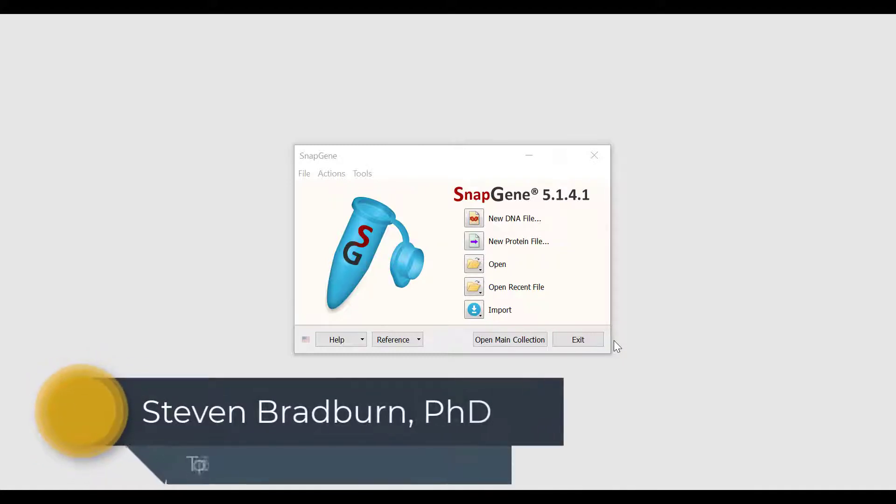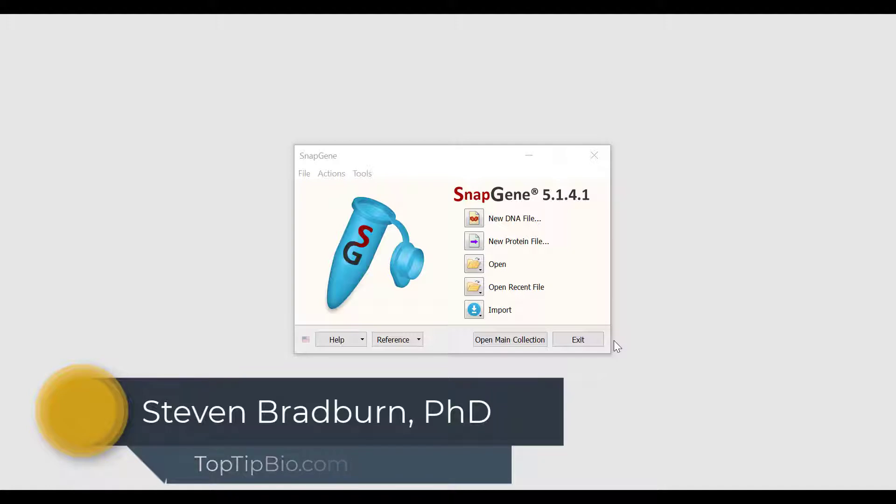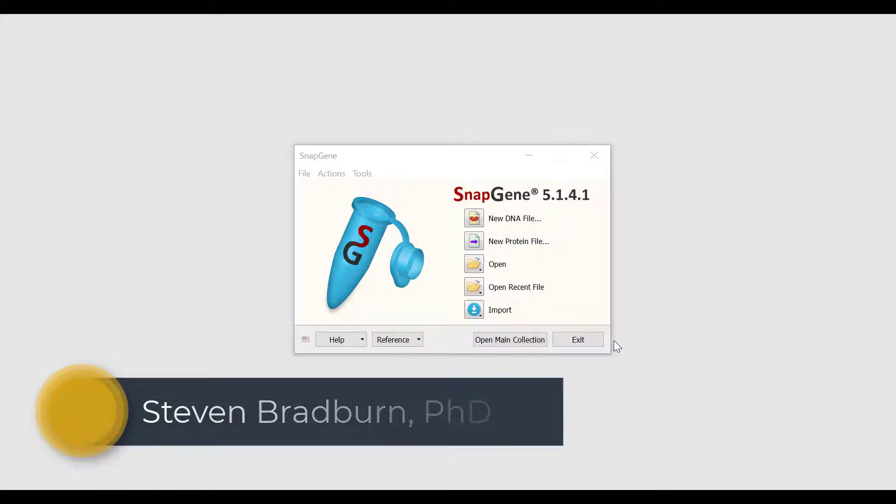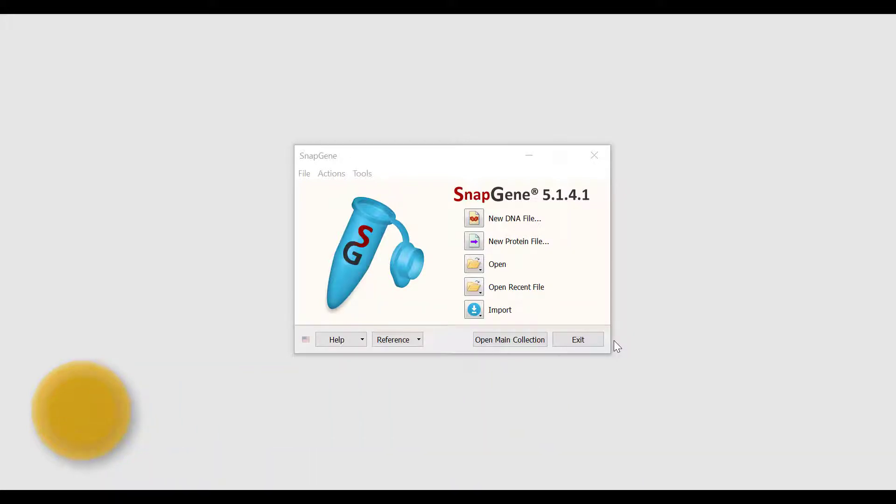In this video we will show you how to simulate conventional restriction and insertion cloning in SnapGene. Restriction cloning is a common cloning technique where restriction enzymes are used to prepare an insert and a vector for ligation.